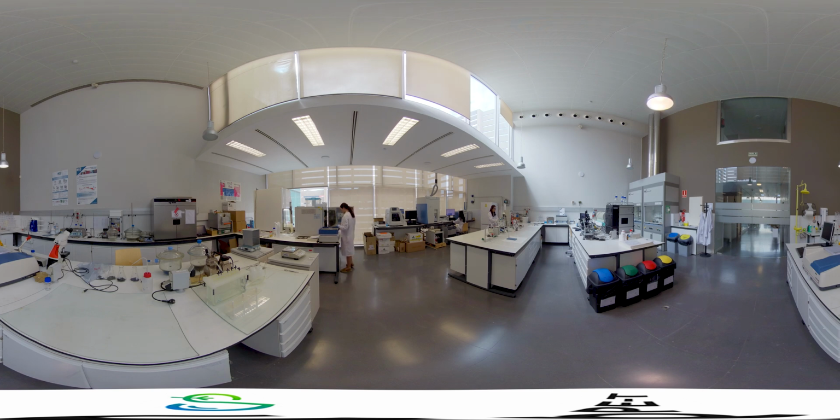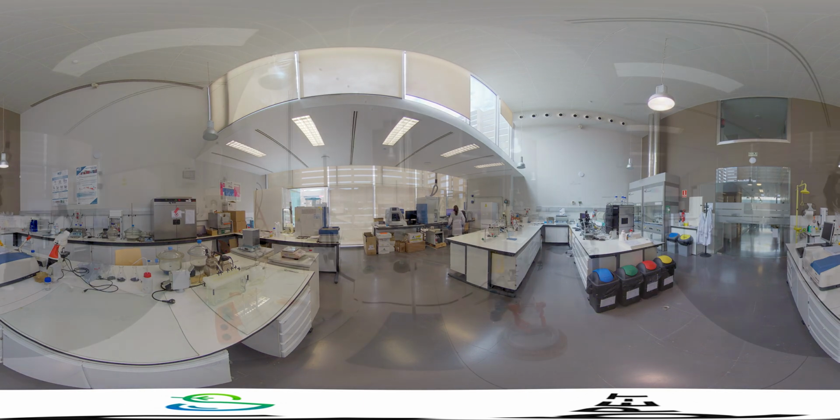To assure the performance of each step, the reaction intermediates are characterized by gas chromatography. These techniques allow the quantification of the conversion and purity of each product. In addition, the molecular weight of polyethylene glycol is determined by size exclusion chromatography.